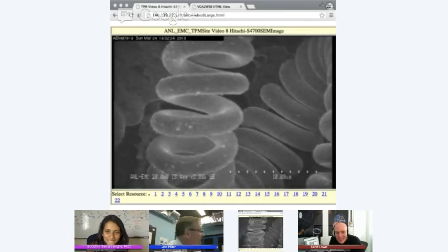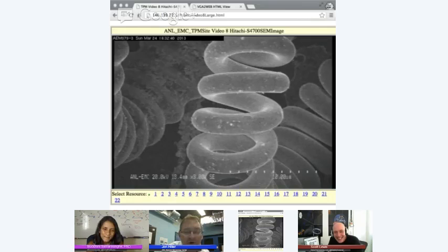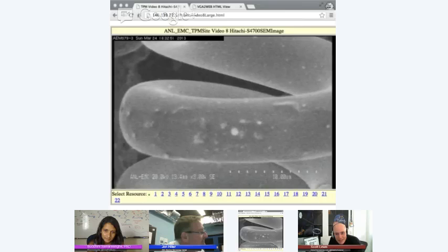Oh, wow. If you were General Electric and you wondered why your tungsten filaments kept blowing, you could then do some failure analysis work on this. Right. And go in and say, well, why did it fracture here? Is our tungsten not pure enough, or are there impurities or whatever? And so you can then move into where the area was fractured. And that is amazing. And take a look at that.